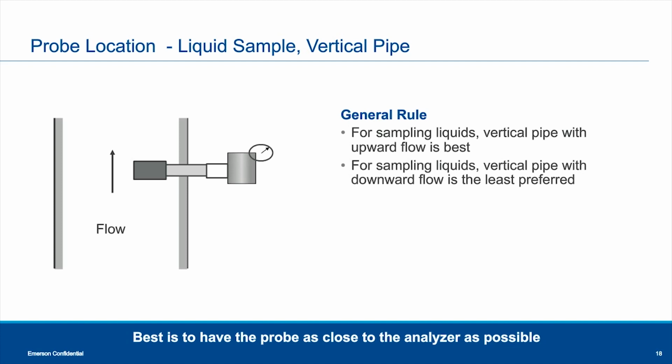And as we put on the bottom of all these slides, the best thing you can do is have the probe as close to the analyzer as possible. That eliminates a lot of issues. We know that's not always doable, but try to keep that in mind if you're designing a new system.